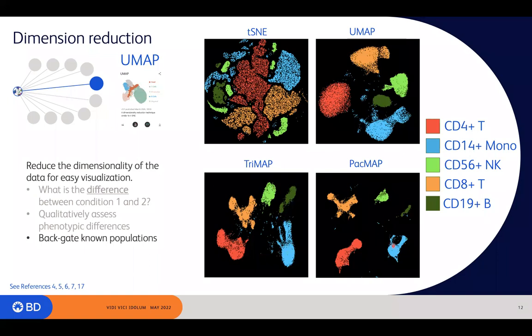The map types of projections are kind of useful, because what you can see here in the UMAP, for example, is you have these two little peninsular populations. This is an indication that, okay, whatever these cells are, they're still monocytic, but they're probably beginning to express a single marker that is different from the bulk of the population that is present here.